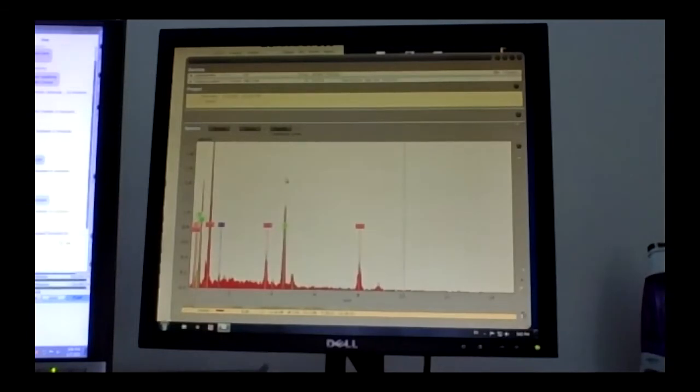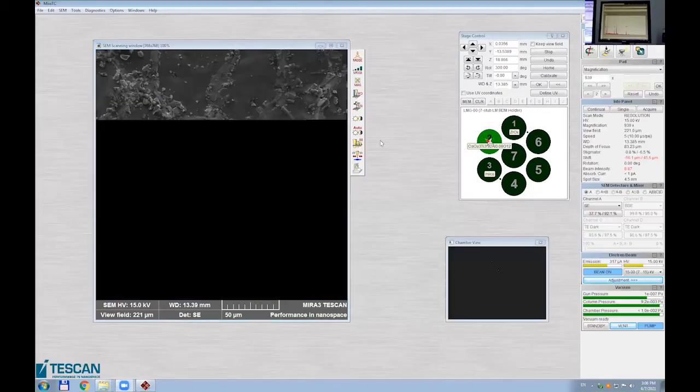So I will share the screen here. This one. So here you see the Tescan software. Do you see?